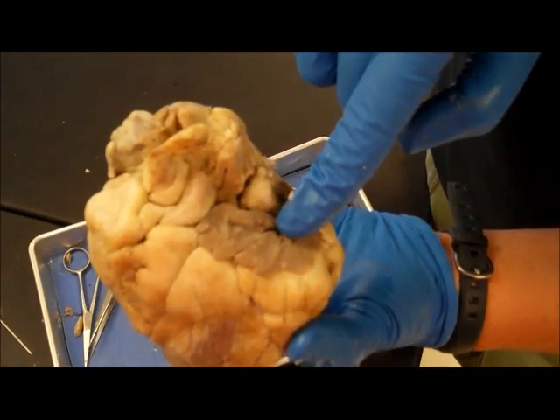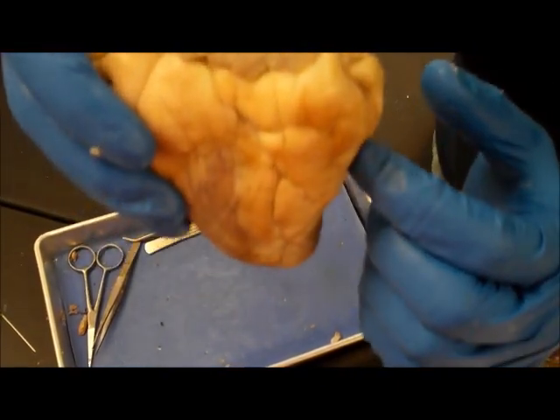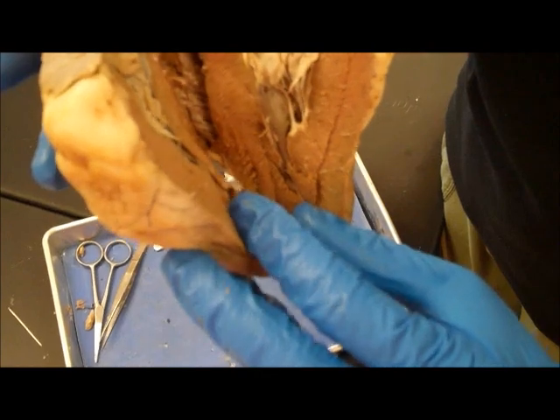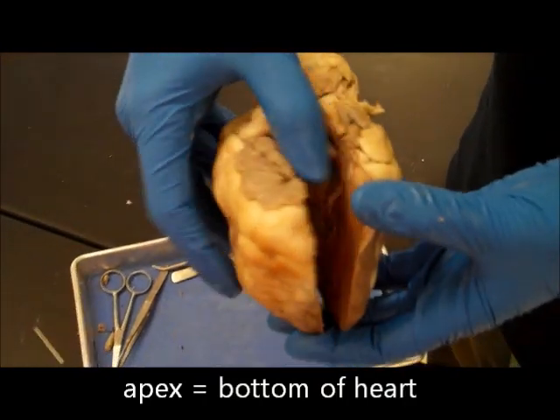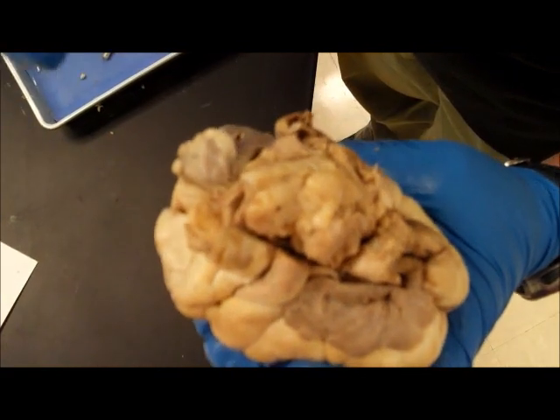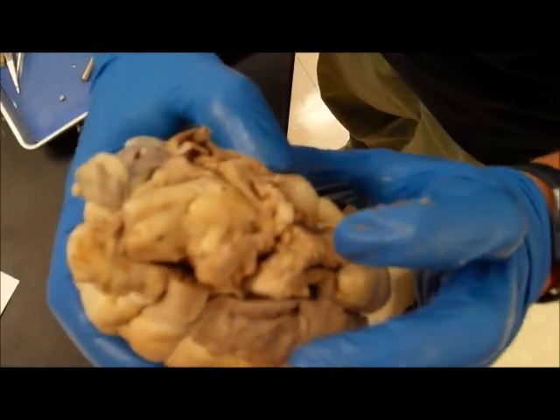We continued over, cut into the left atrium, and around the heart and down through the left ventricle to the apex or bottom part of the heart. And now I'm going to open this up, and we left some of the heart intact so we could unfold it. So what we're going to do now is trace the path that blood would follow as it flows through the heart.